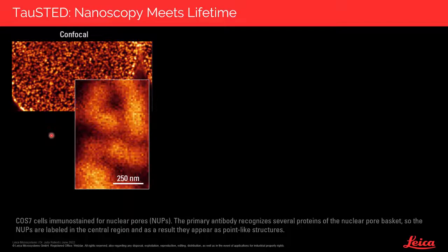And to do that, I selected this example on this different sample that shows very nicely the essence behind our development. What we have here are nuclear pores immunostained with Alexa Fluor 555, using an antibody that targets the pore basket. We expect to get point-like structures, but their sizes are way smaller than the diffraction limit, so we cannot really resolve them. And if we think of the live cell imaging experiments I have shown so far, what we aim to do, one would like to approach STED in a very gentle light dose condition approach.